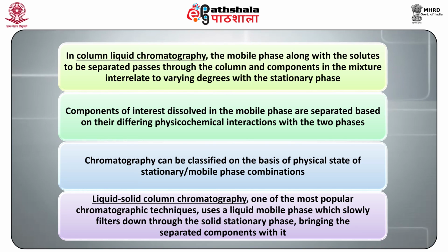Chromatography can be classified on the basis of the physical state of stationary and mobile phase combinations. Liquid-solid column chromatography, one of the most popular chromatographic techniques, uses a liquid mobile phase which slowly filters down through the solid stationary phase, bringing the separated components along with it.